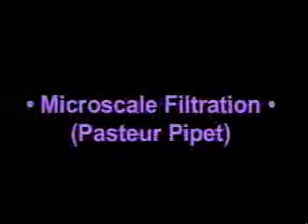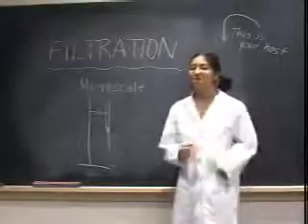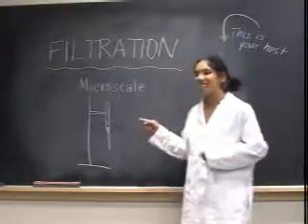First, let's address microscale filtration. We'll be using the Pasteur pipette to carry out this type of filtration. I bet you never thought you could have this much fun on such a small scale. Here's how to prepare your filter pipette.